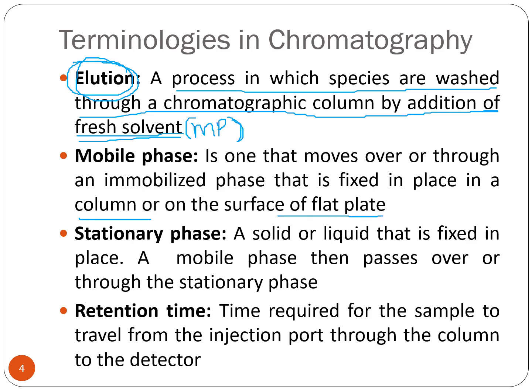Okay, so basically mobile phase ni adalah phase yang bergerak, yang boleh bergerak, yang wash away your mixture into component. Okay, while the stationary phase, stationary adalah yang tak bergerak, a solid or liquid that is fixed in a place. A mobile phase then passes over or through the stationary phase.